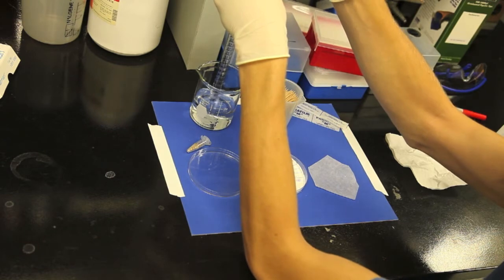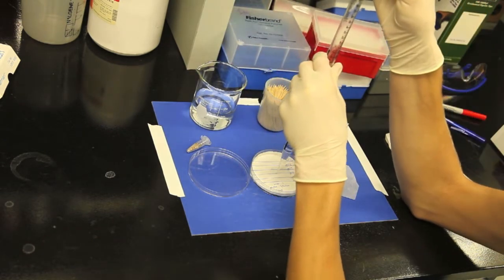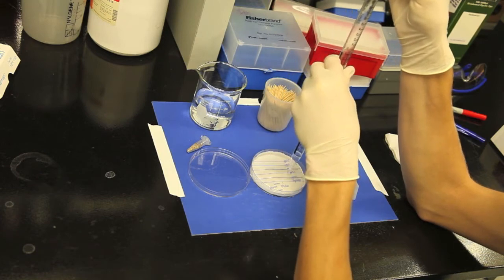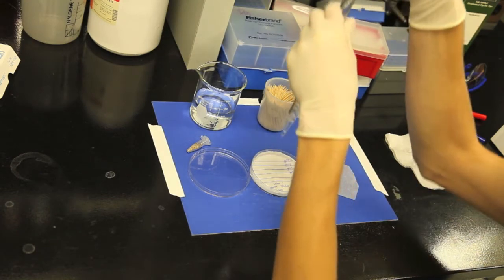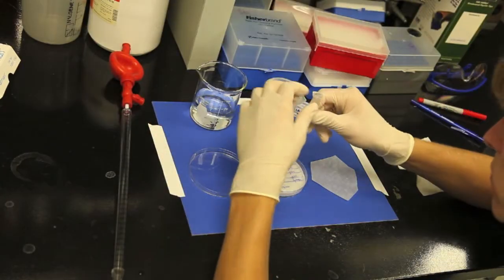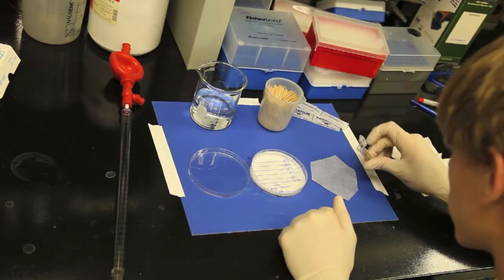Pipette six to eight milliliters of either water or gibberellic acid solution into each of your plates. Your goal is to soak the filter paper without leaving any standing pools of liquid. Once you've completed these steps for every plate, you're ready to spread the seeds.